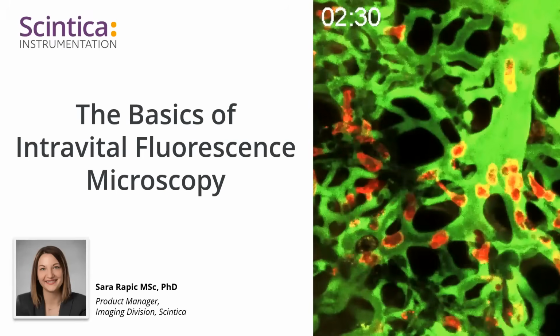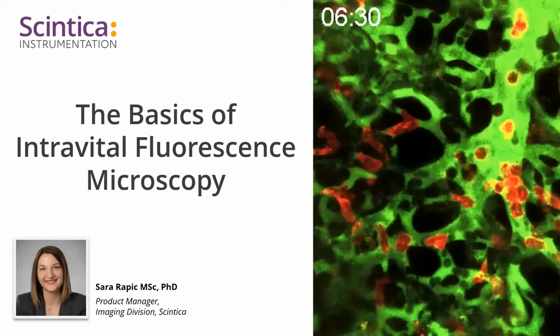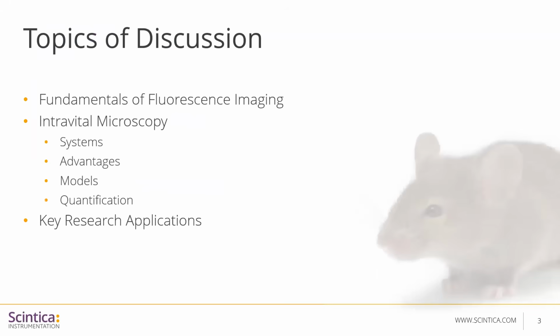Thank you for that introduction, and a big welcome to all of you attending today's webinar on the basics of IntraVital Fluorescence Microscopy. We'll start off with fundamentals of fluorescence imaging, after which I'll introduce you to IntraVital microscopy systems, advantages, models, and some quantification methods. And we'll close off with key research applications of the modality.